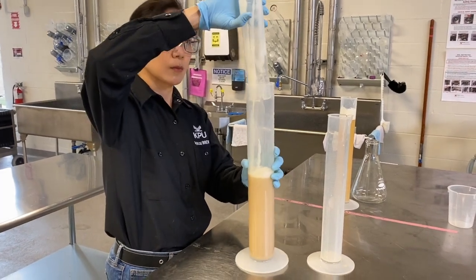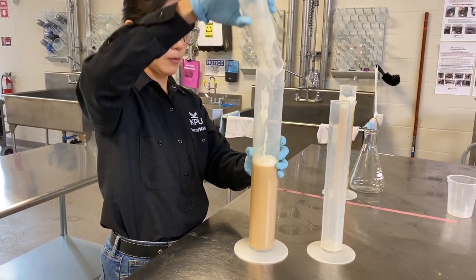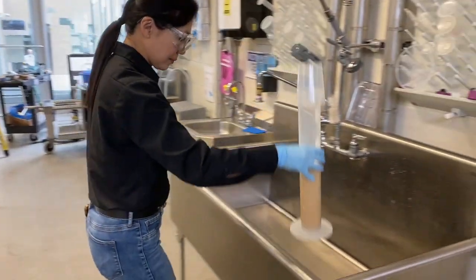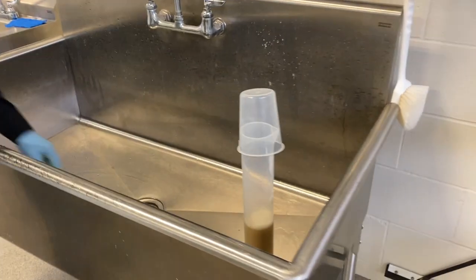If you do not have a lab shaker, use a 1 litre measuring cylinder for fast fermentation. Make sure to swirl well after adding the yeast slurry. Leave the sample in a sink overnight.